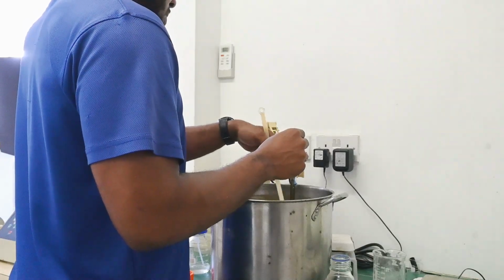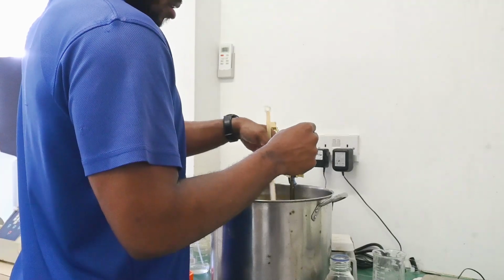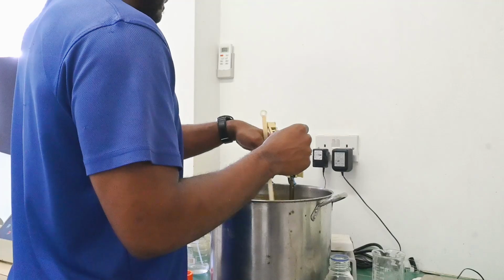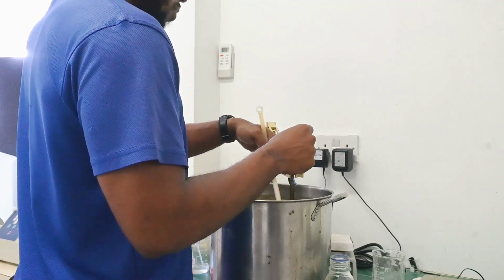It varies based on the concentration of the hydrochloric acid or the sodium hydroxide, how many points it goes down, but usually maybe 4 to 5 per drop.